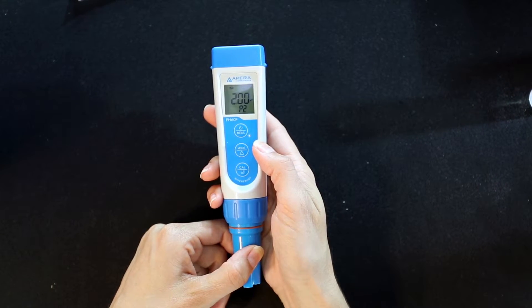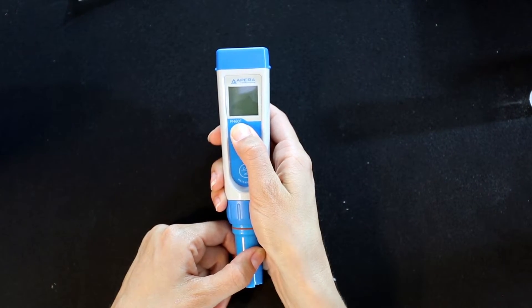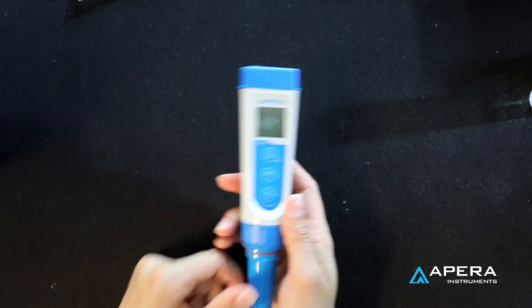After adjustment, press the enter button to confirm, then long press the power button to turn off. When turned on again, the heads up function will be ready to use.